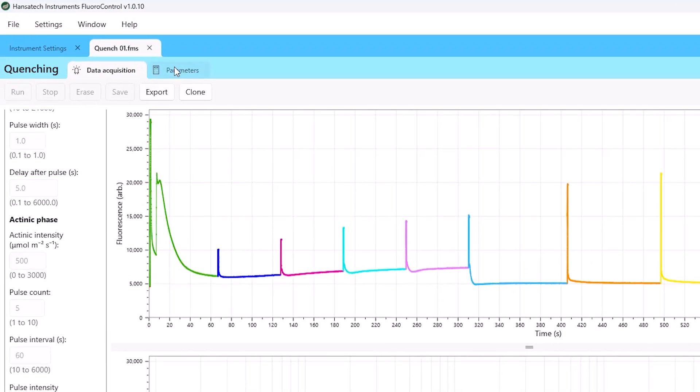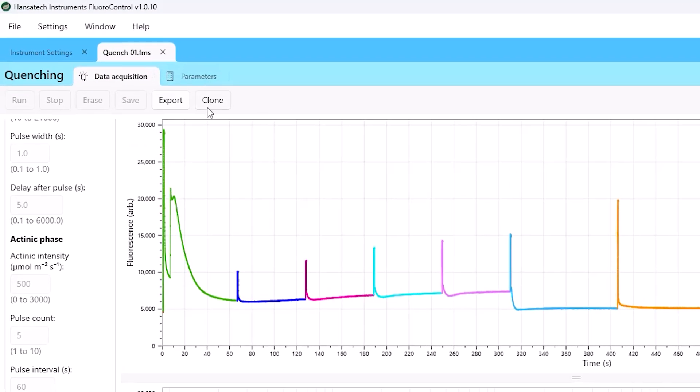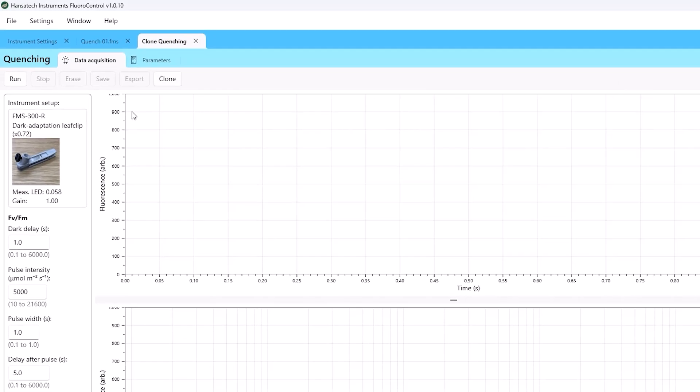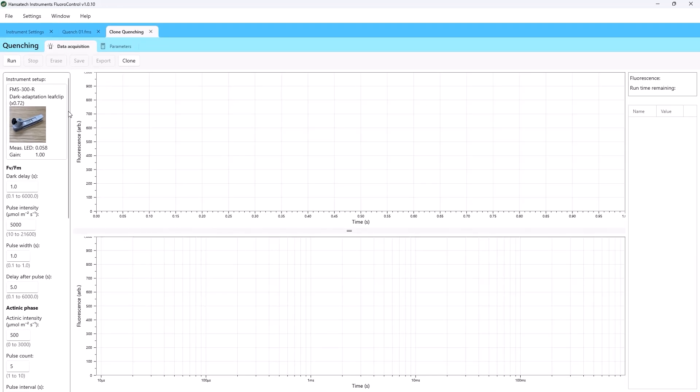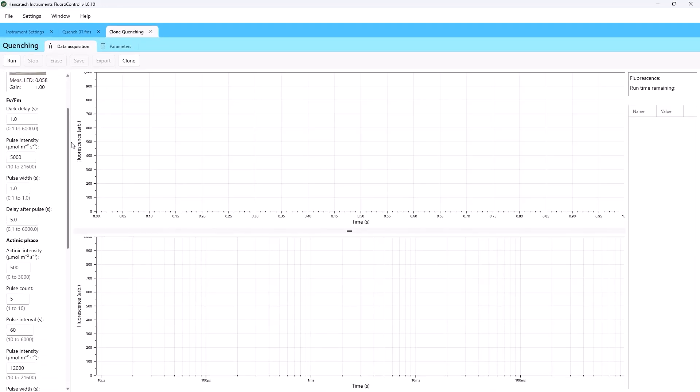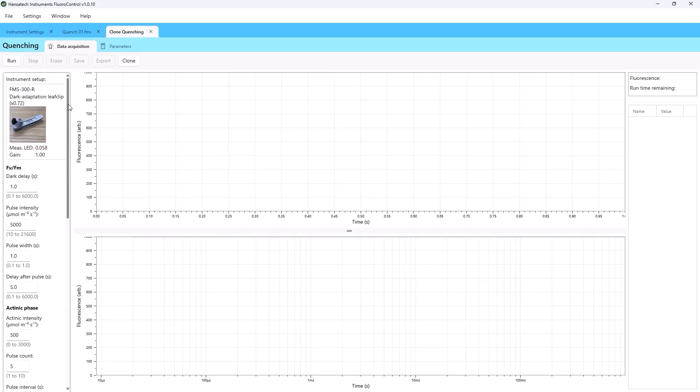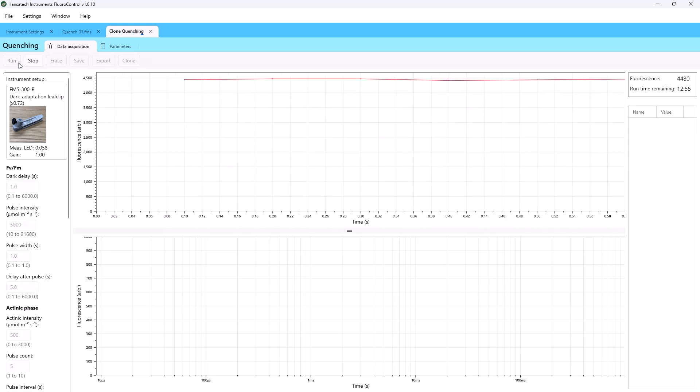To replicate a configuration, open a saved file and click Clone. This creates a new experiment with the same configuration as your source file. You can now run the replicate measurement.